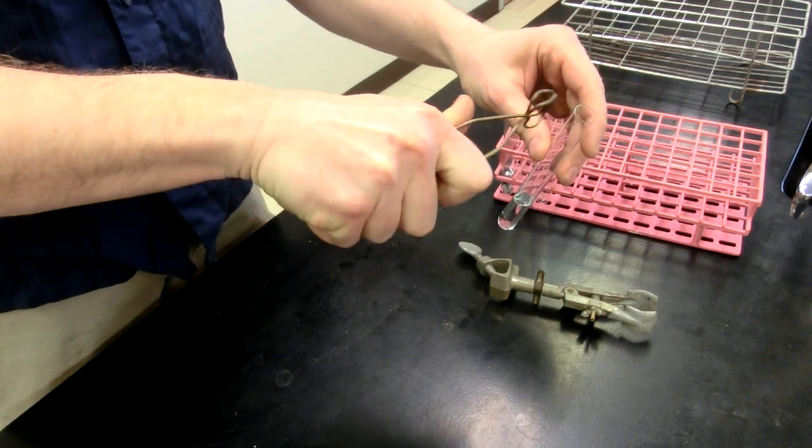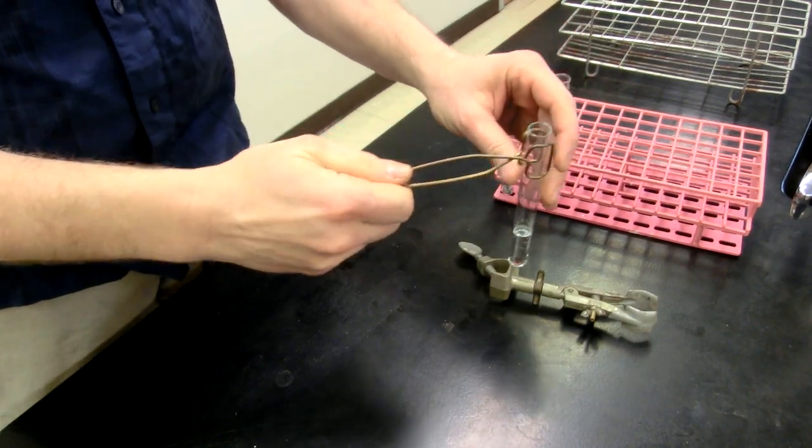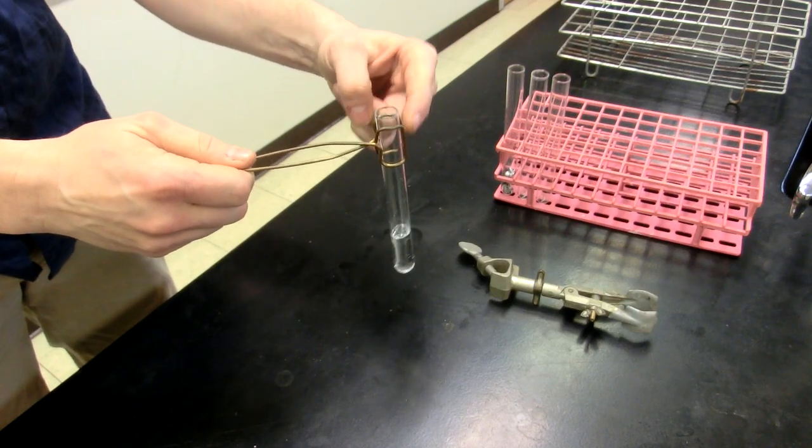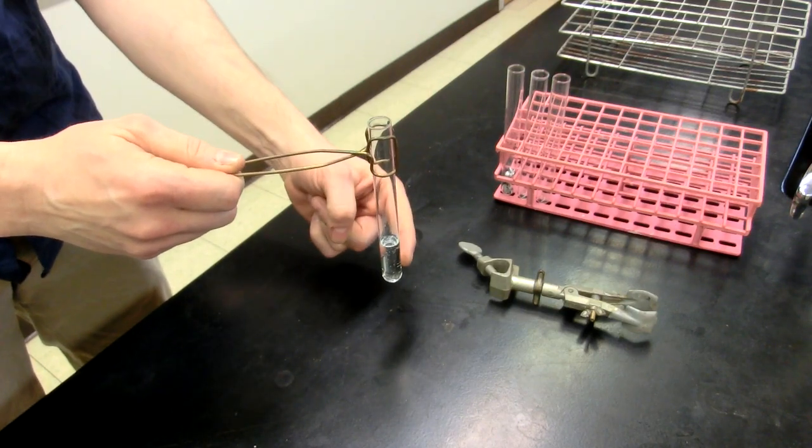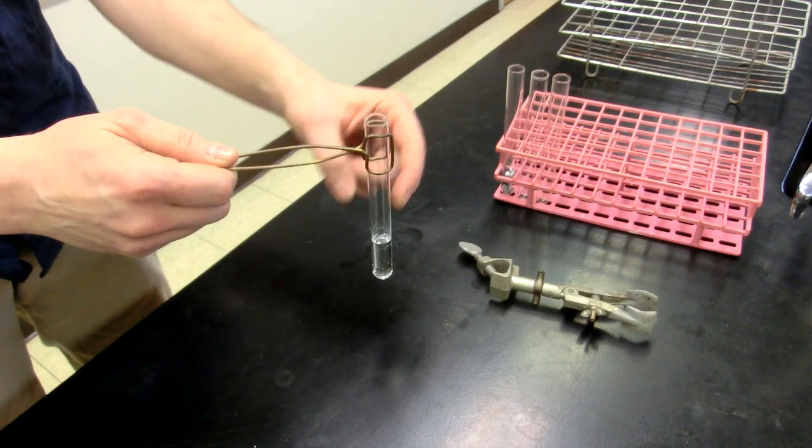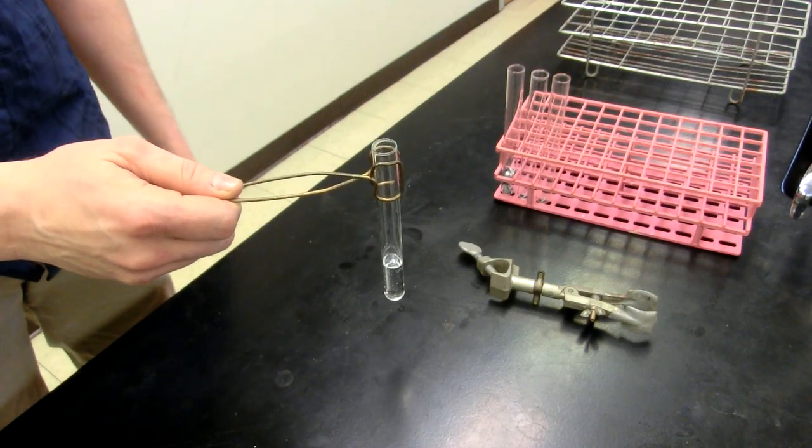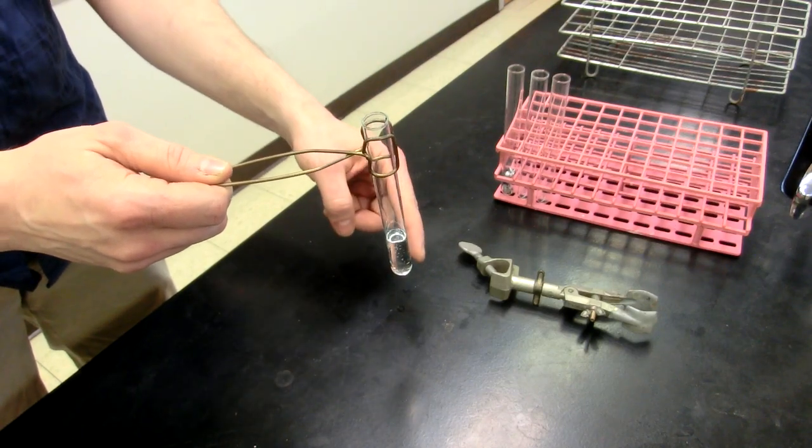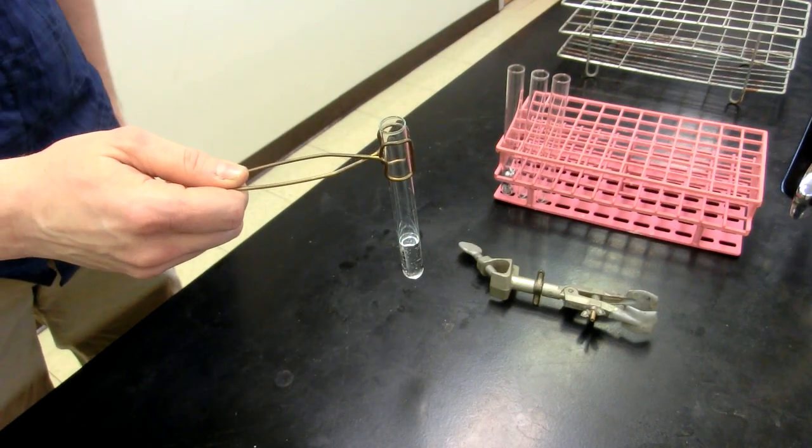You'll notice that I have the test tube holder toward the top of the test tube, not at the bottom of the test tube, not in the middle of the test tube, but at the top. Reason for that is because if you go to heat this, you want the metal as far away from the flame as possible.